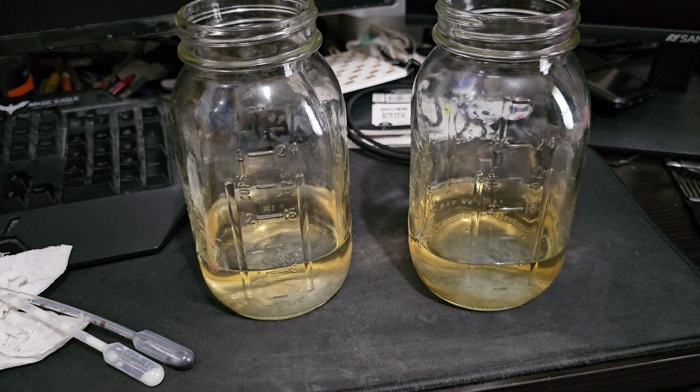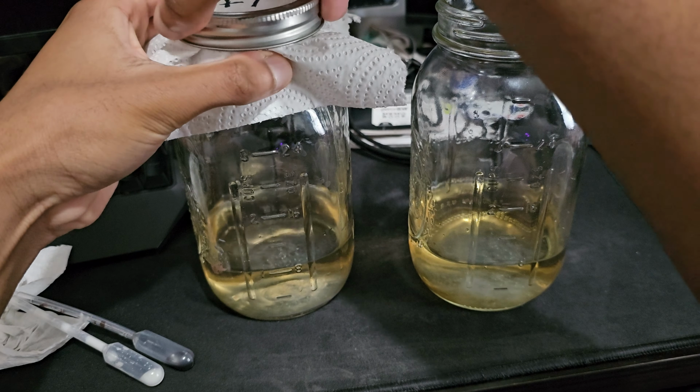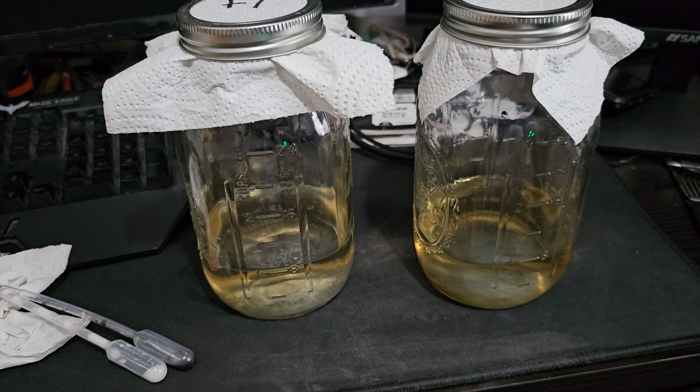Let me label it on the paper towel. We'll call one FT for fish tank. Go ahead and seal that off, and then we'll take the other one. We'll just say D for distilled water. Alright, so I'll leave this, just do like I did last time, just leave it sitting somewhere. I don't think it should smell. There's a very little bit of milk in there, so if it smells, I'll fix something out. But I'll just leave it until Saturday.